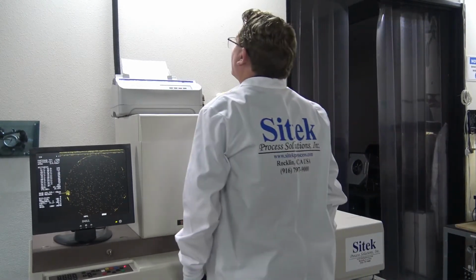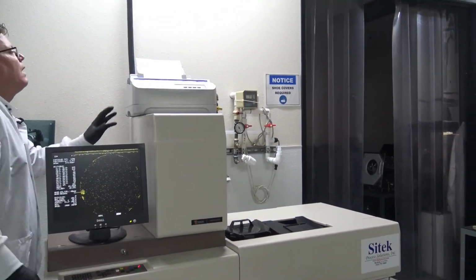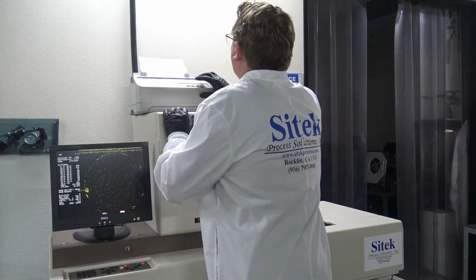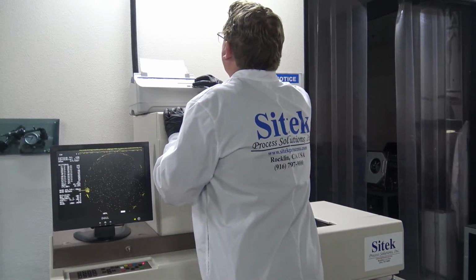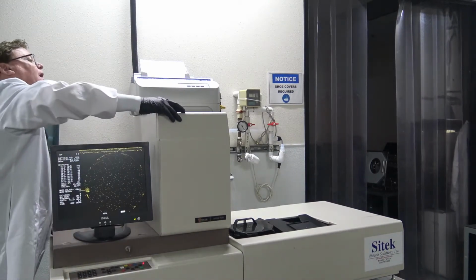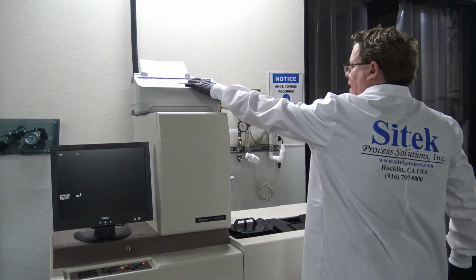Make sure my paper is indexed correctly. If I can see up there. I'm going to index a little bit higher. I'm going to micro-feed it up a little bit. Good, okay, the paper's up. No, this normally goes on the table next to it.